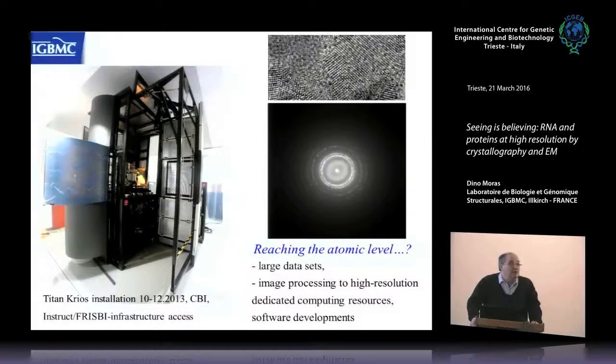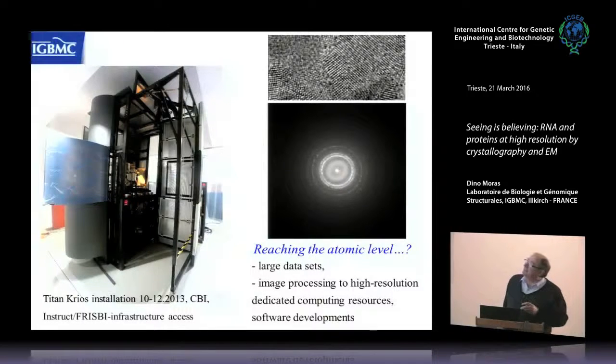Now we have this, I told you, the new generation things, and I will come back to this technical, we compare things, what that means. And the new generation of machines in cryo-EM, this is the one we have in Strasbourg, Cryos, which was installed 2 years ago. Actually 2 years and 2 months now. It was in December 2013. That was first installed.